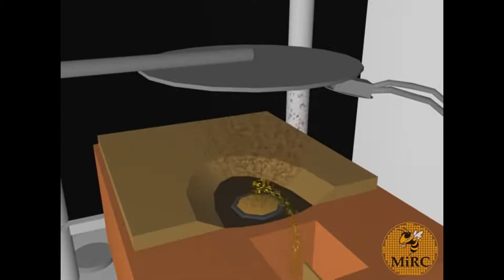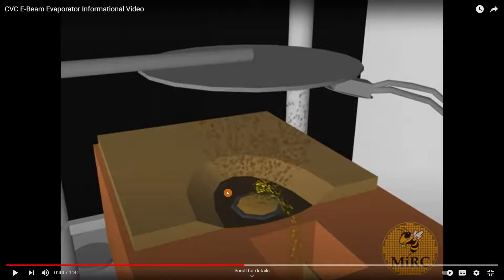This process can take several minutes. Here I show the e-beam. When you have electrical current going through the filament, it becomes the electron beam, guided by the magnetic field, hitting the source material.